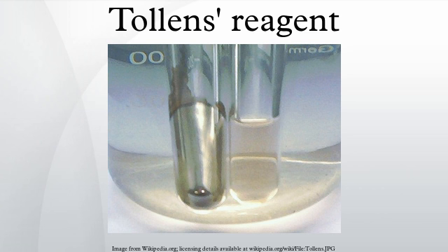In the next step, sufficient aqueous ammonia is added to dissolve the brown silver(I) oxide. The resulting solution contains the [Ag(NH3)2]+ complexes in the mixture, which is the main component of Tollens reagent. Sodium hydroxide is reformed: Ag2O + 4 NH3 + 2 NaNO3 + H2O → 2 [Ag(NH3)2]NO3 + 2 NaOH.